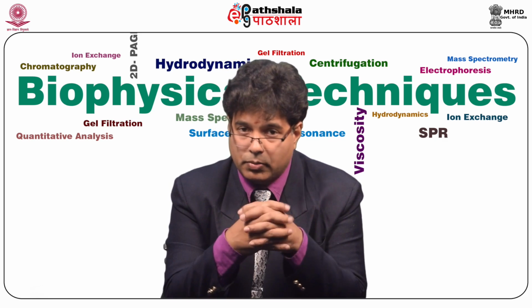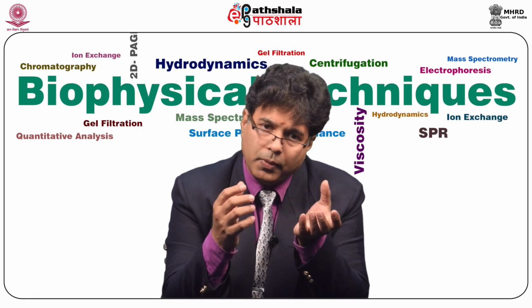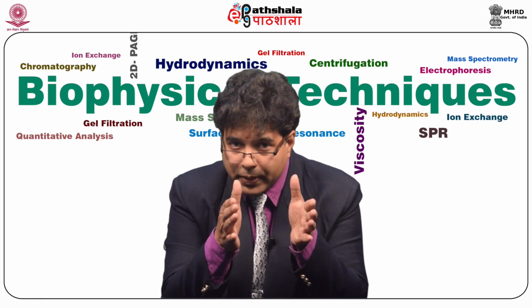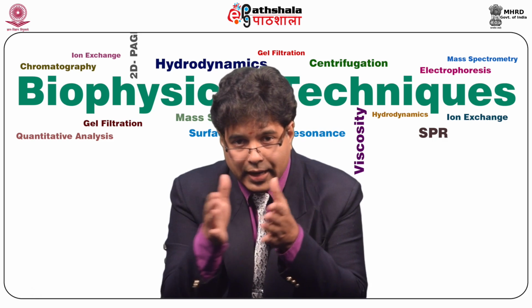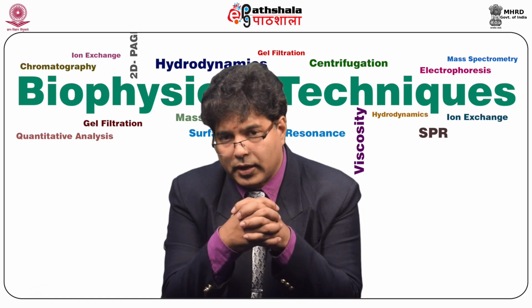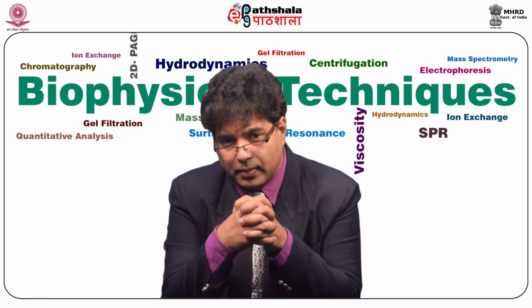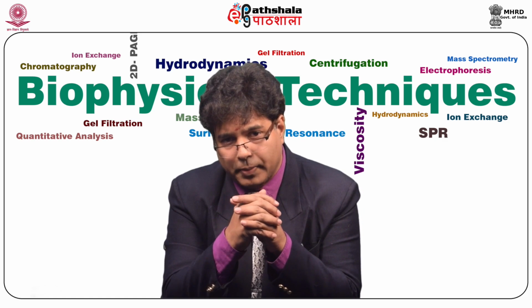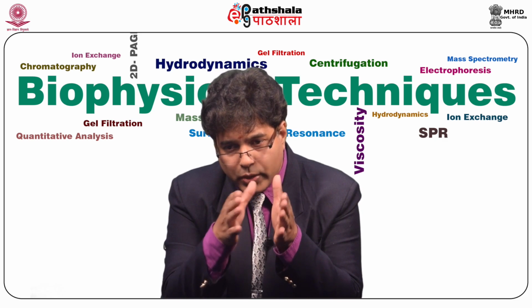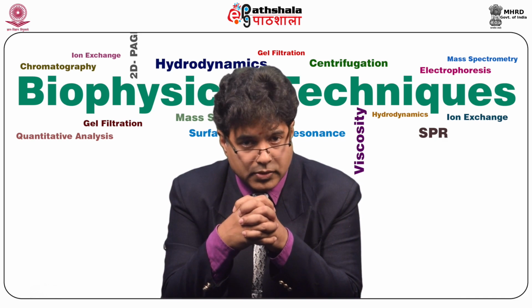Whereas quadrupole mass spectrometry is predominantly for analytical purposes. Sometimes we use a quadrupole coupled with time of flight together to get better separation by using the quadrupole and getting the resolution by using the reflectron. FTICR is another model, in which ion cyclotron resonance is used. Tandem mass spectrometry, as I told you, can be done by sequential fragmentation of ions, and they are measured as their fragments.